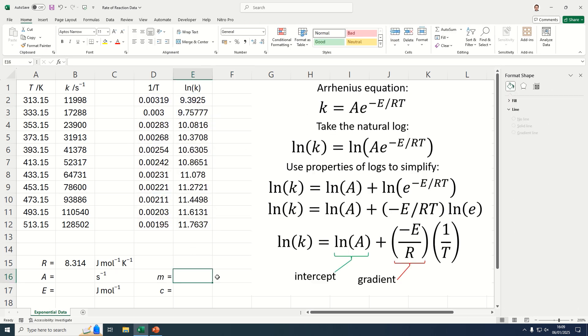So we can use the function equals SLOPE to get the gradient and these are the y-axis values. And these are the x-axis values.